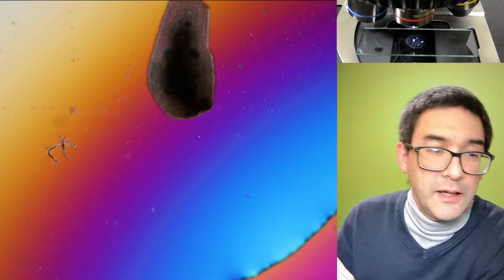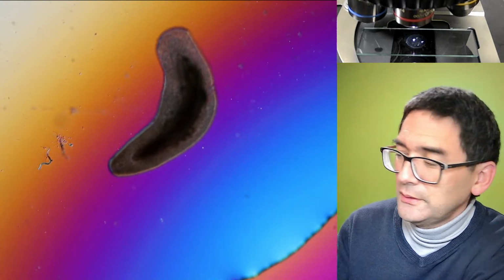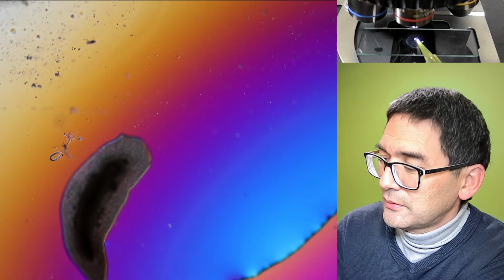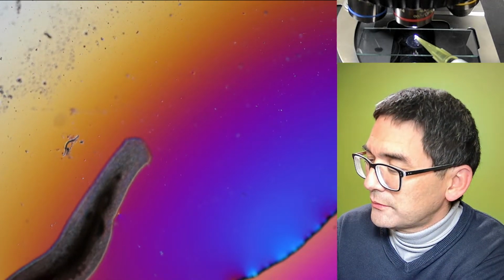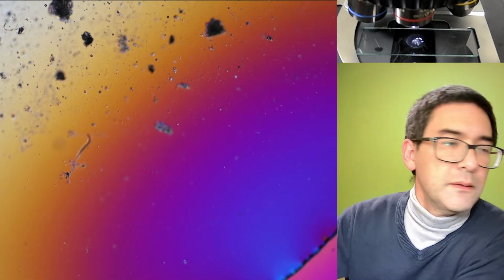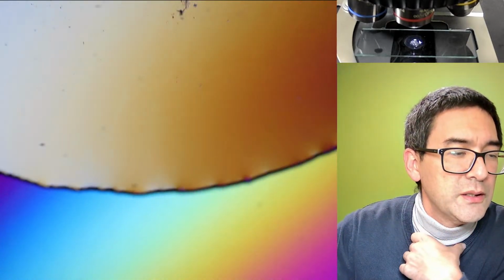Okay, really, I have never tried this myself. So just to have a look at what I'm doing here on the top, then you can actually follow along as well. So I'm adding a little bit of this. I don't know if this was enough. Here we go. You can actually see that those little things here are part of the chip. Let's have a look at what the nematode worm does. The nematode worm really doesn't care.